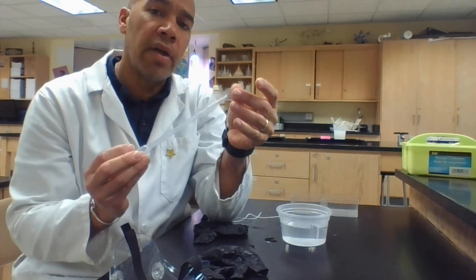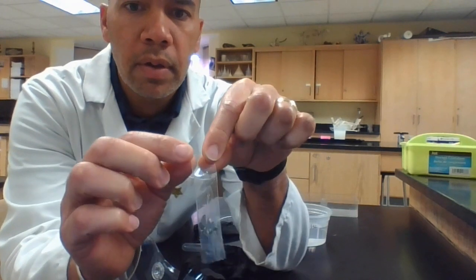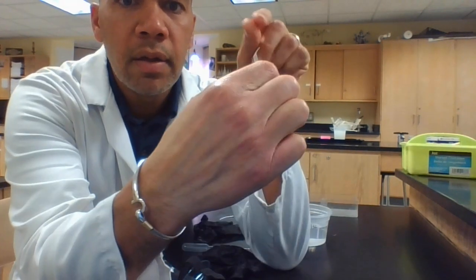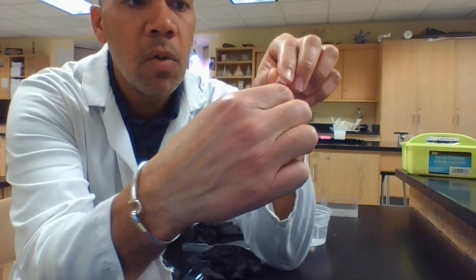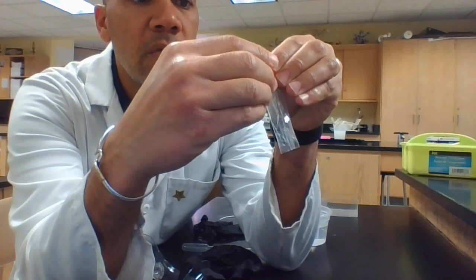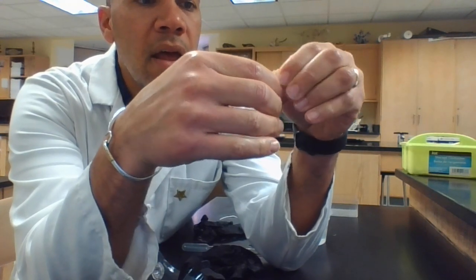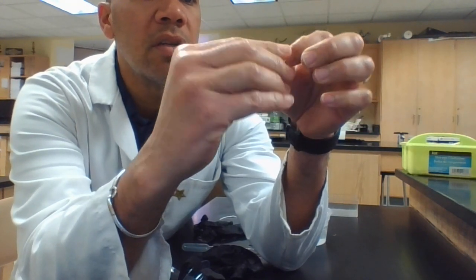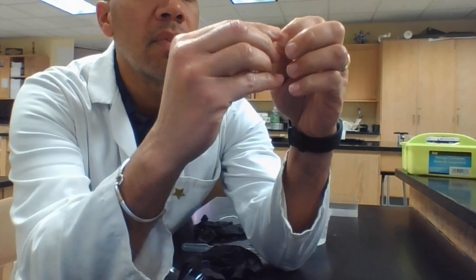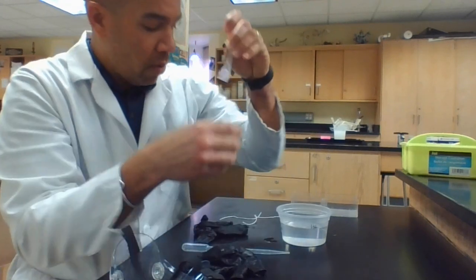You're going to tie the other end by folding over. Okay, so I'm folding this end over once and then slightly over again. Okay, and then I'm going to twist just a little bit, almost like a candy wrapper is twisted, and the other partner is going to tie that end with the string.